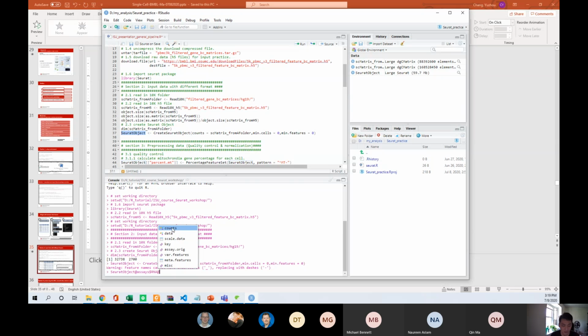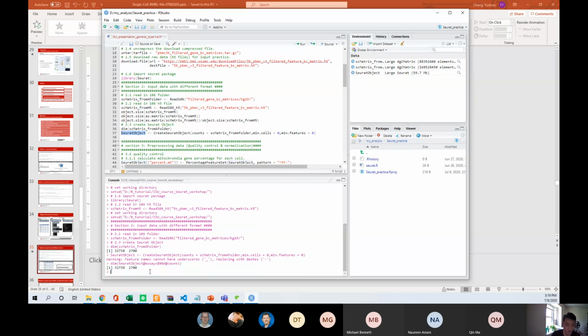The data counts means you have already imported the raw data into this object. And you can also recall the raw counts by using this command. To prove that, I can run the dim function one more time. Okay, they're the same as the original matrix. So this way, you can call back the raw counts matrix.